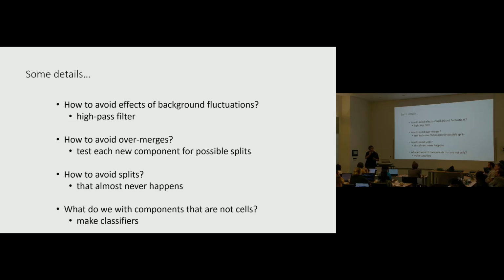Basically there's a slider, right? And there's a trade-off of whether you want things to be more oversplit or more overmerged. If we could automatically figure out that slider for every data set, that would be ideal. Hopefully we'll get something of that sort. But if not, it would still be useful if you had some slider that you can figure out yourself on at least one of your data sets, and then it's the same for all of your data sets.